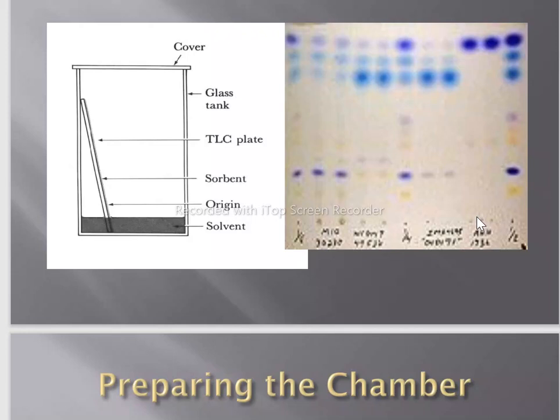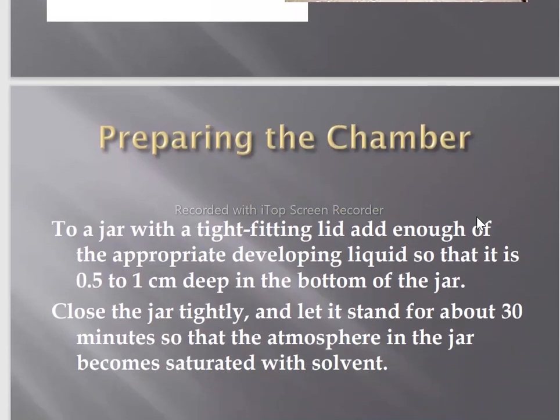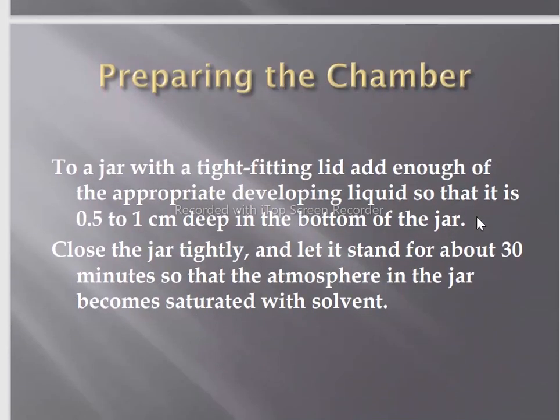So it is clear what is TLC and what is a TLC plate. Preparing the chamber: what type of chamber do we want for the development of TLC, or to run the TLC plate? TLC, thin layer chromatography.